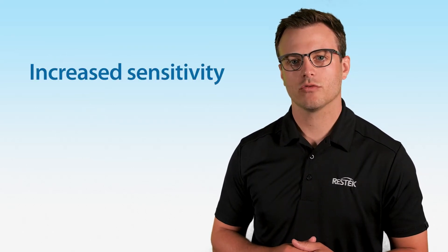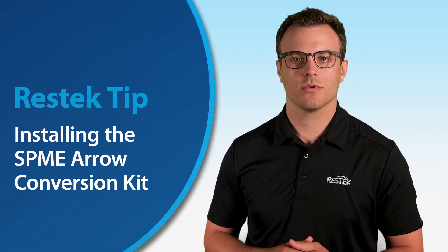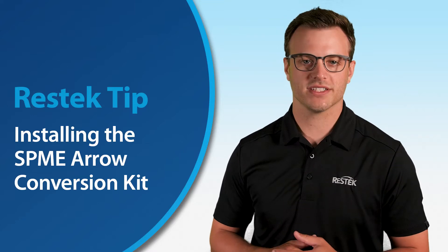The SPME Arrow is a versatile and robust sample preparation device offering you increased sensitivity, reproducibility, and ruggedness. In this Restek tip, we're going to show you how to configure your GC to take full advantage of this technique.